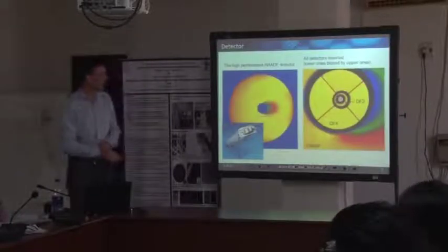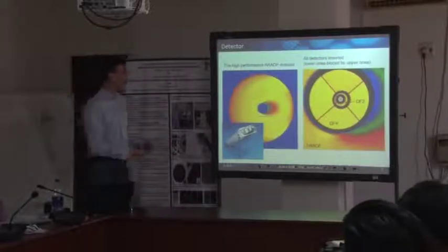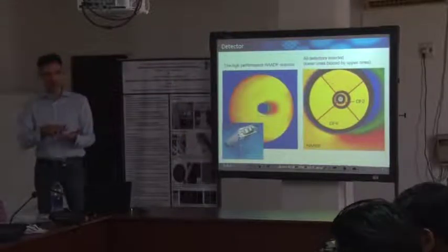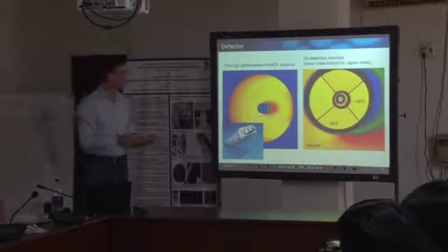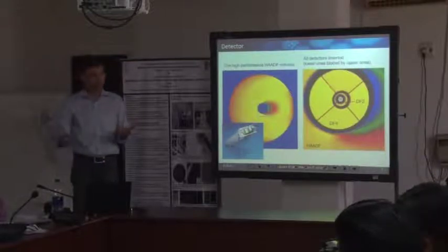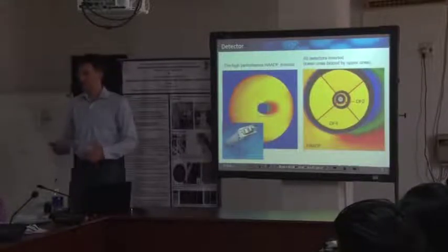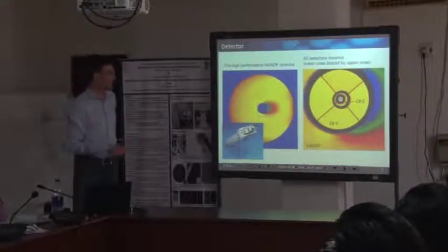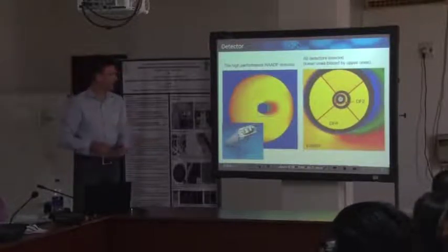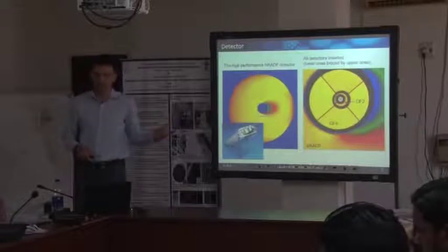This is how a detector looks like. In principle, most of those detectors, in particular if you have a very sensitive detector, have an active area, and on this area you just have some scintillator material that converts our electron beam into a light signal, which is guided out of the microscope, and by using a photomultiplier, this optical signal is amplified. So this is just an annular detector that covers this range here, and just in the center is a hole. So this is a dark field detector.